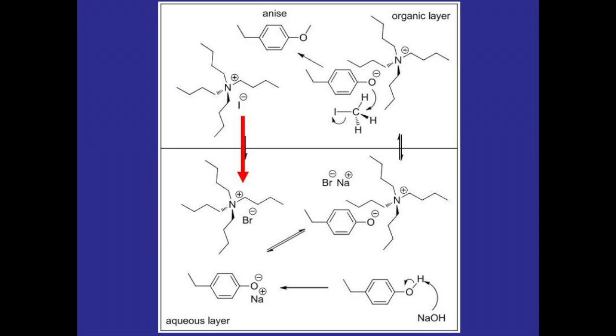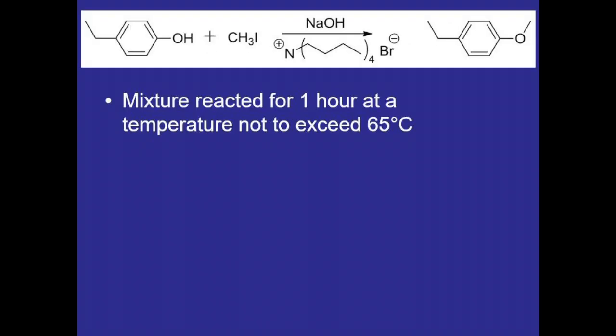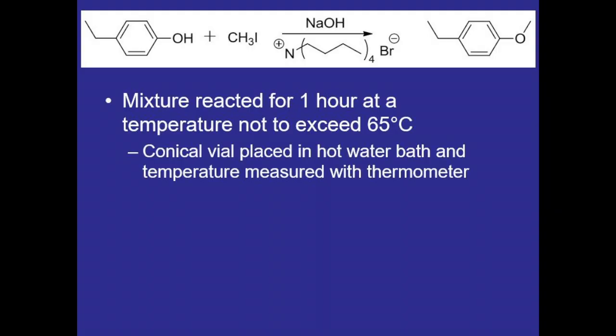To allow this process to fully happen, we'll allow the mixture to react for an hour at a temperature not to exceed 65 degrees Celsius as the methyl iodide refluxes. In order to monitor this, we'll place the conical vial in a hot water bath and measure the temperature of the water using a thermometer.